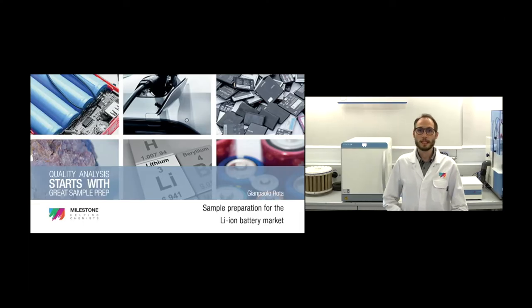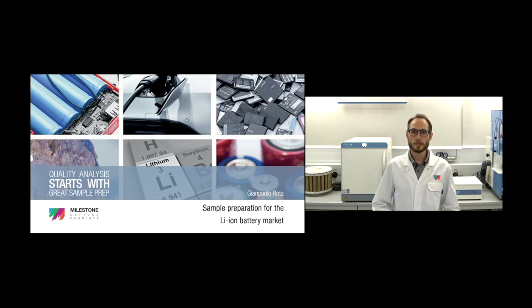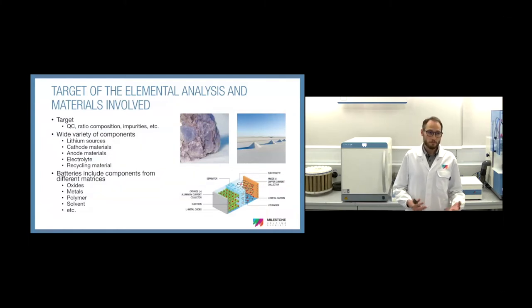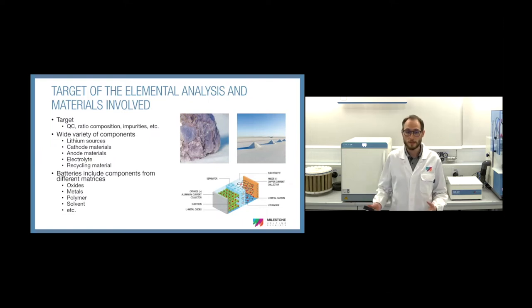Thank you, Serena, for the introduction and welcome to this part of the event where we will spend some words about sample preparation. We have already seen the importance of elemental analysis during the presentation of Jean-Louis, and that basically the target of the analysis is to check the quality of the material or to check the composition of the raw material.